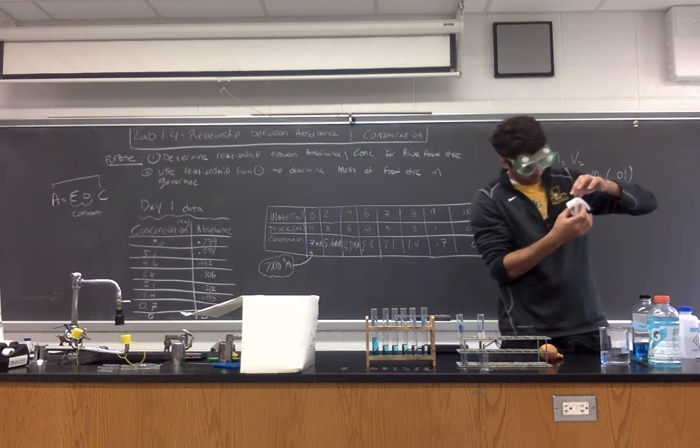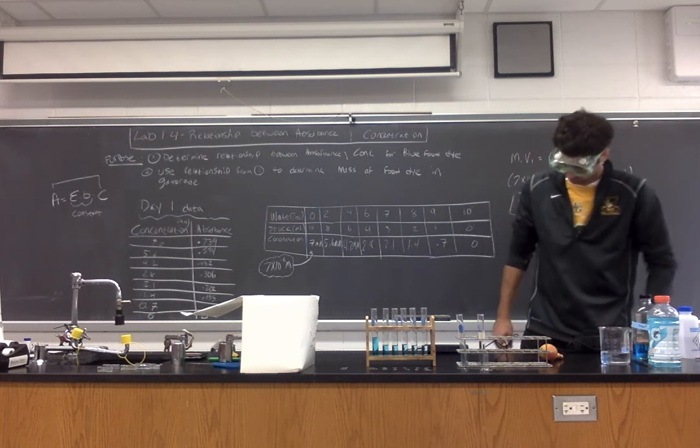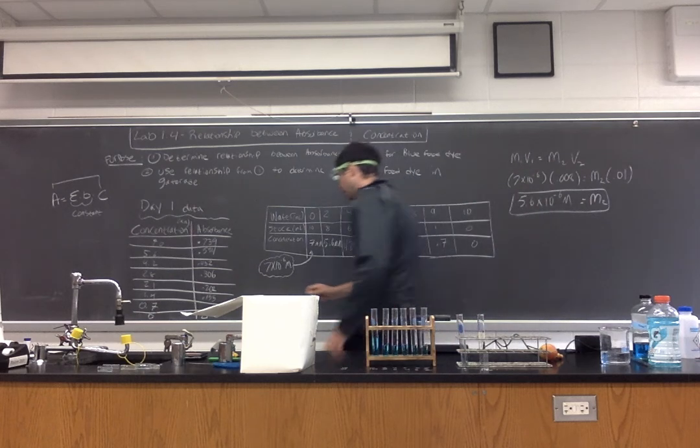Last time wiping off fingerprints. 0.091.